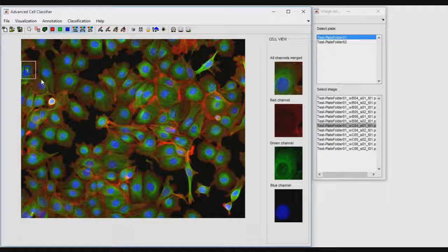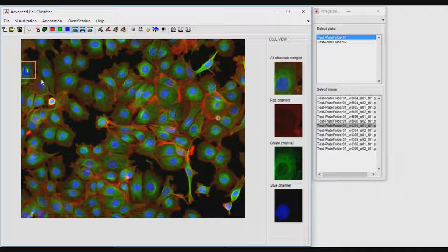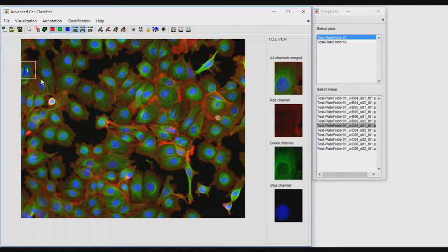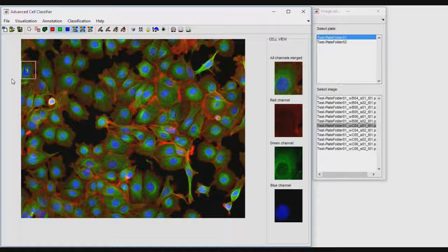The three basic cell classification steps are creating classes of interest, annotating representative cells, and automatically classifying non-annotated cells.